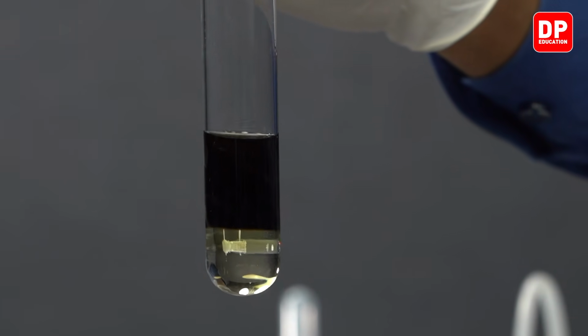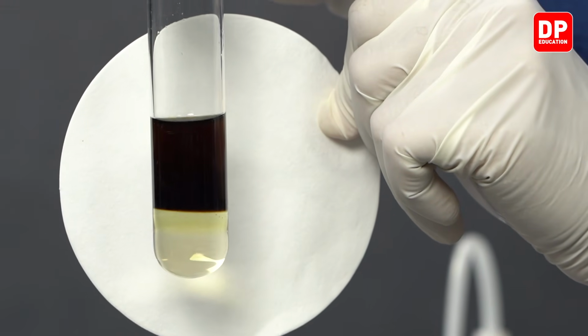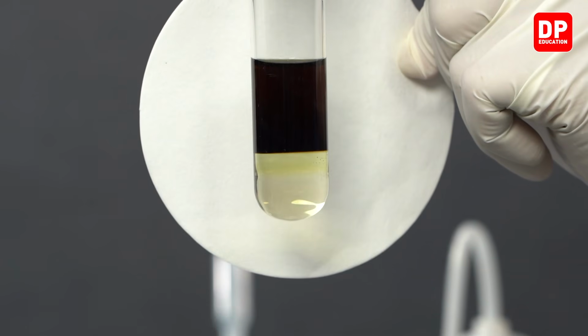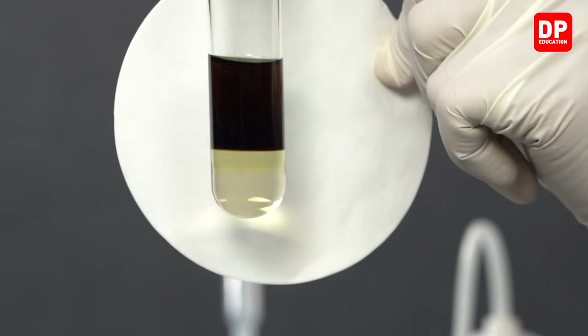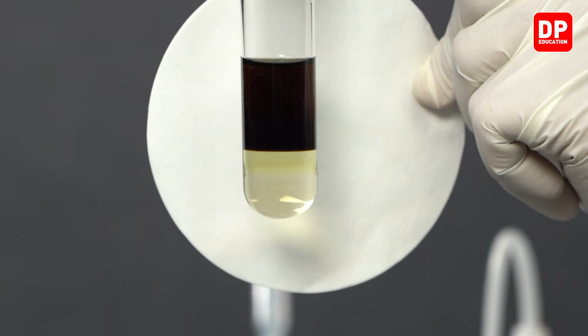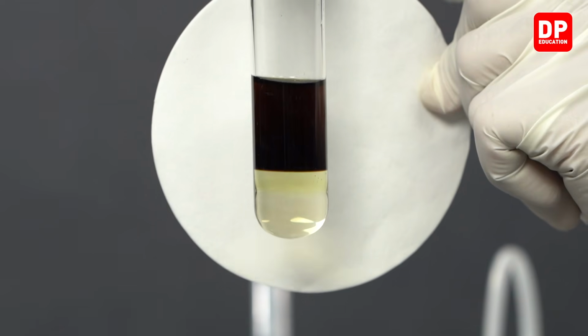So to avoid this from happening, we ask not to shake this mixture so that we can very clearly observe the brown ring that is formed at the interface between the sulfuric acid layer and the aqueous Fe2+ nitrate ion layer.